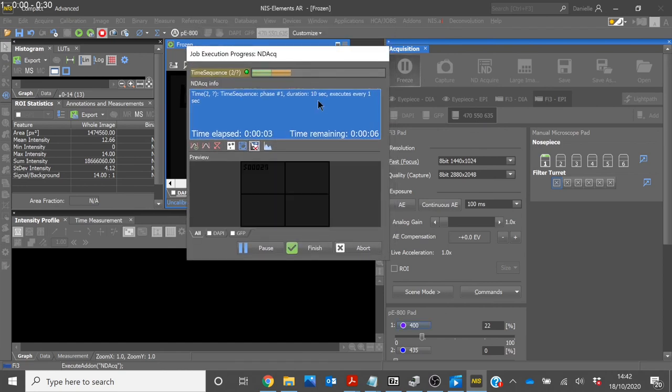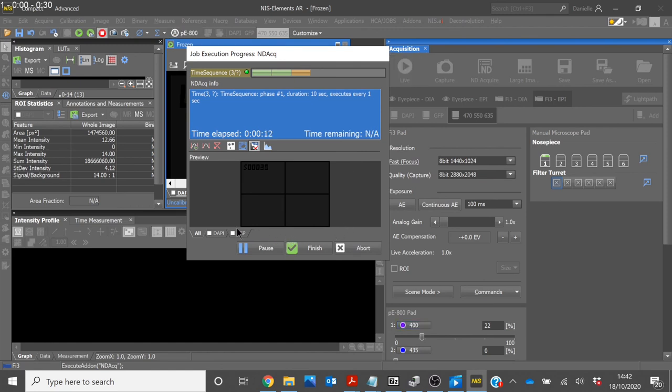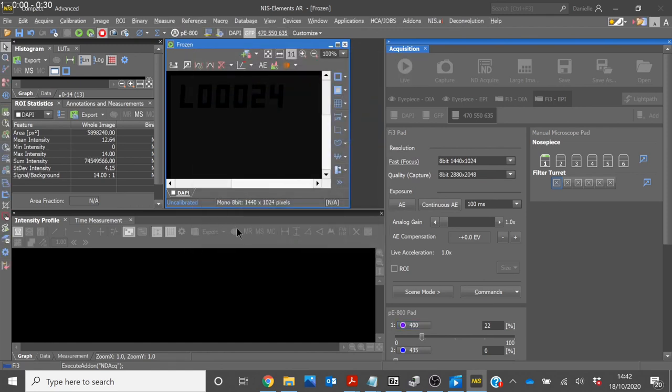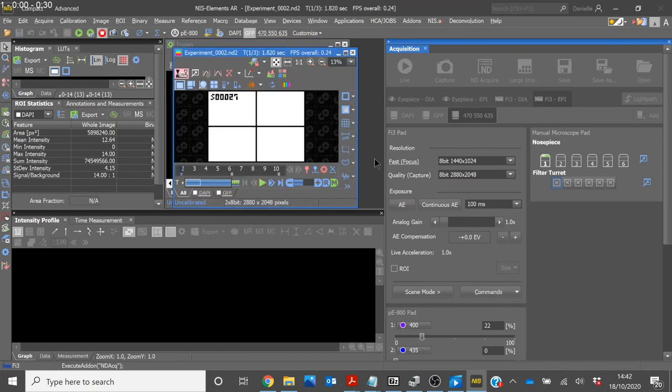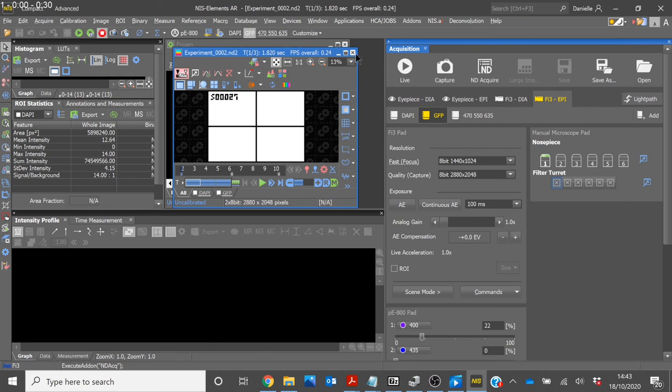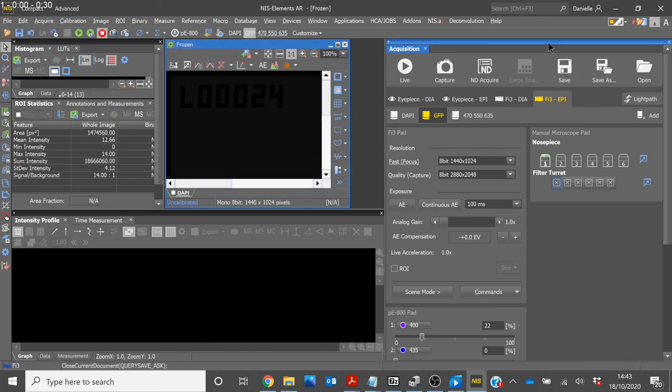As we are using a simulation camera, we have a simulation image. But this is where you would see the image of your sample. You can then continue to run more experiments. Once you have finished, you can simply close the NIS Elements software.